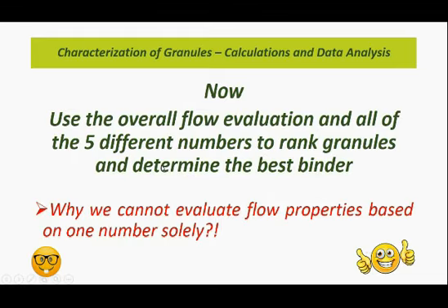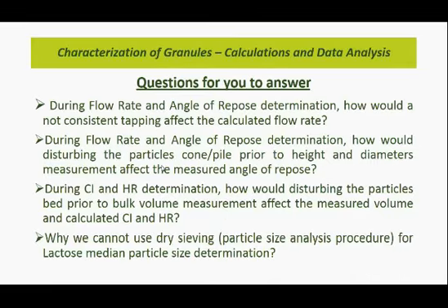I cannot emphasize enough the importance of the use of all numbers to evaluate flow properties, since each flow properties indicator is affected by different factors, and these factors are the determinants of the overall flow properties. Again, we cannot evaluate flow properties based on one number solely.